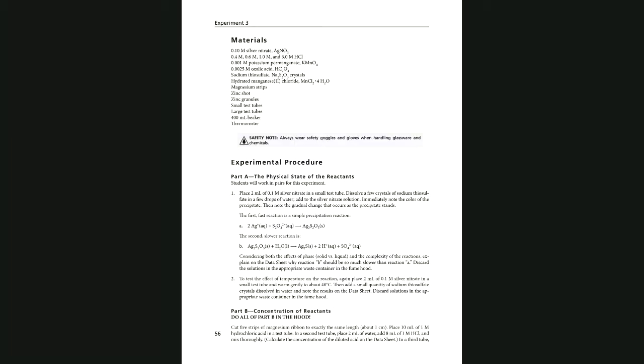Sometimes there are like 4 different parts of the experiment. Some parts of the experiment cover more than just the state. In this, for part A, we have the liquid or aqueous solution for reaction A, and then reaction B is a solid that is reacting with water, and we want to compare the rate when the state is changing. And also for part A2, we are going to increase the temperature and see how fast this reaction is going to take place at the higher temperature.